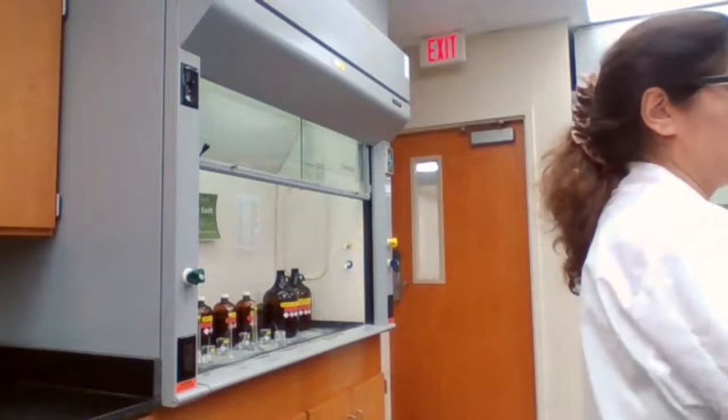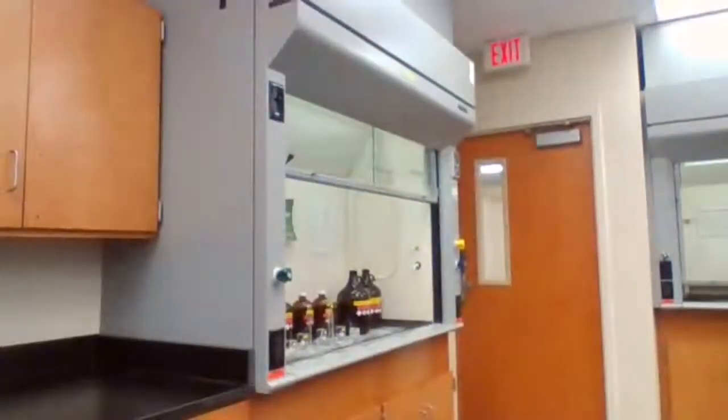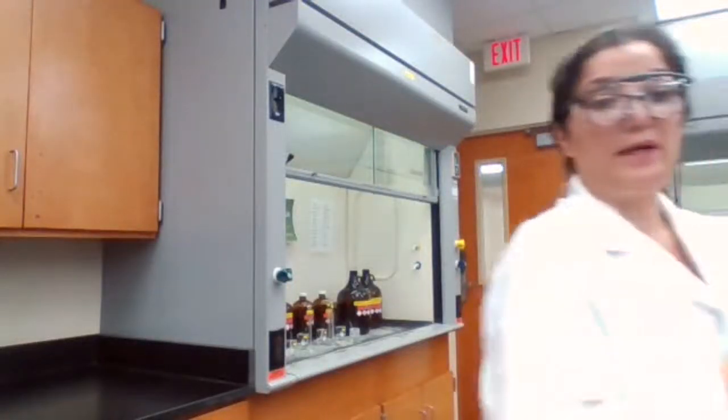Going to label so we know which one is which. Label a test tube for acid and one for base. Today I performed 3 experiments.